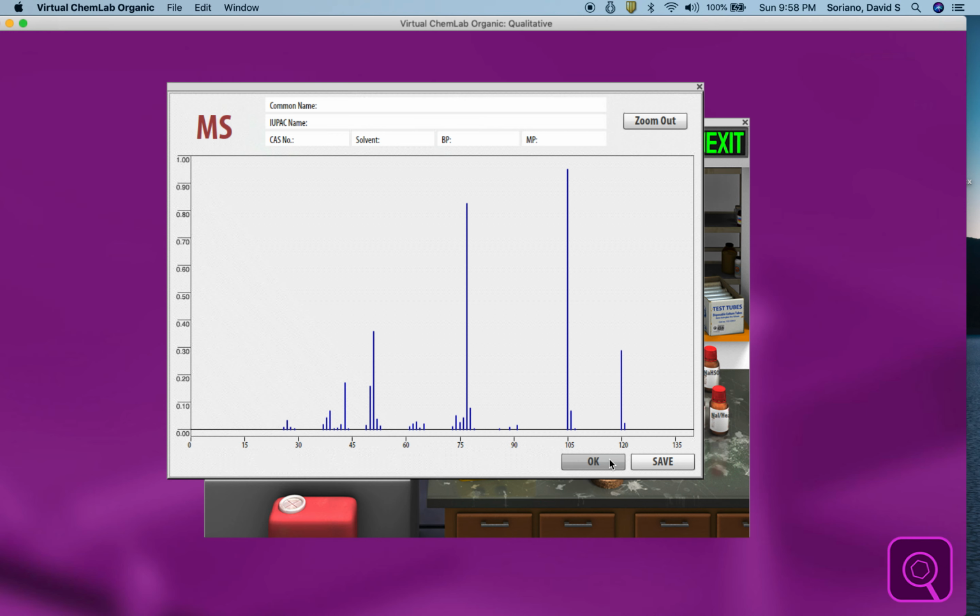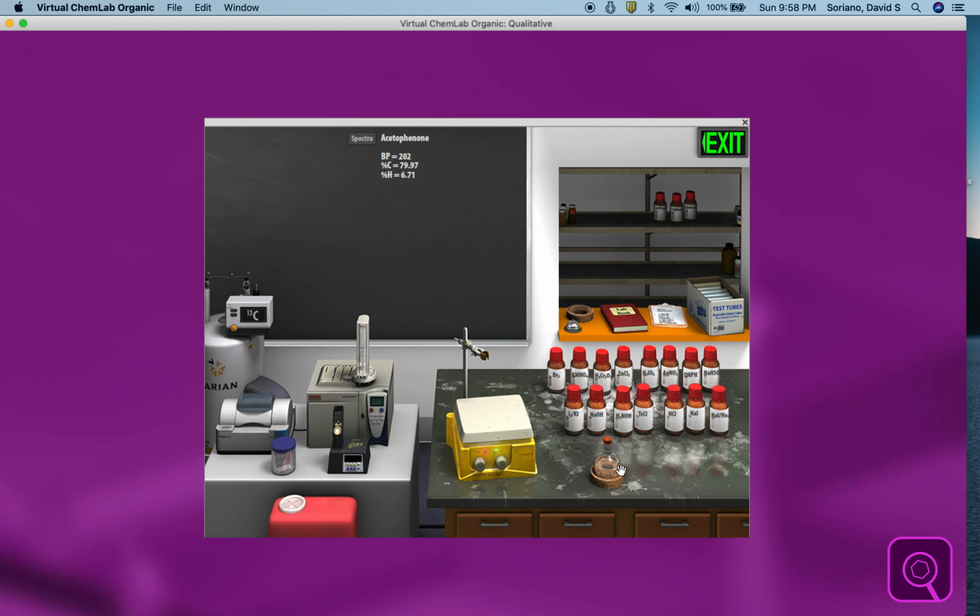Here's the mass spec, fragmentation pattern. You get a nice 105 as the base peak, and that's your benzoyl ion. You crack a methyl group off, which is 15, from the molecular ion, which is 120. They give it to you exact, 120.2890. You can dovetail this with the SDBS spectral database online, which carries proton, C13, infrared, mass spec, very nice.